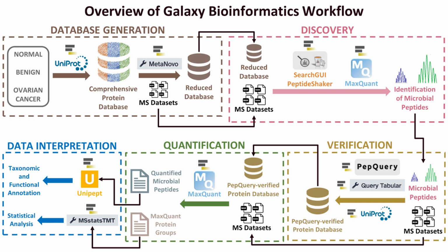In the quantification module, we will use MaxQuant to quantify microbial and human peptides and proteins separately to compare results. Lastly, we have our data interpretation module. Here we will perform statistical analysis using MS-Stats TMT and taxonomic and functional annotation using Unipept.